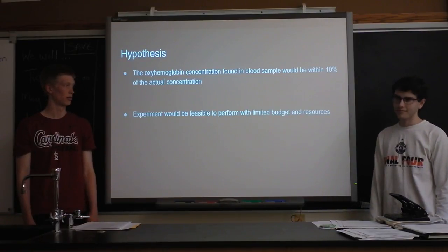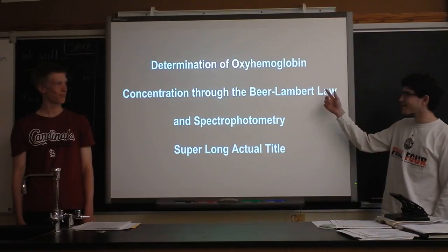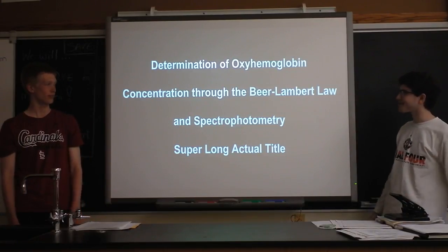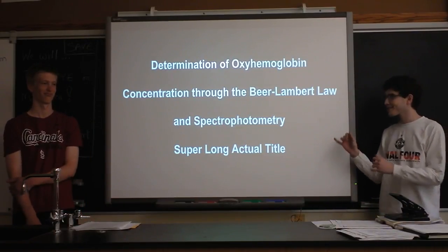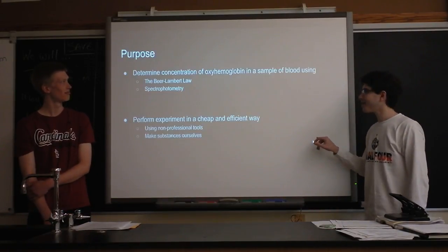Okay, so this is our actual title, and it's really long, so we made a false title page because it's way faster. The title of our project is the determination of oxyhemoglobin concentration through the Beer-Lambert law in spectrophotometry, which is our super long actual title.